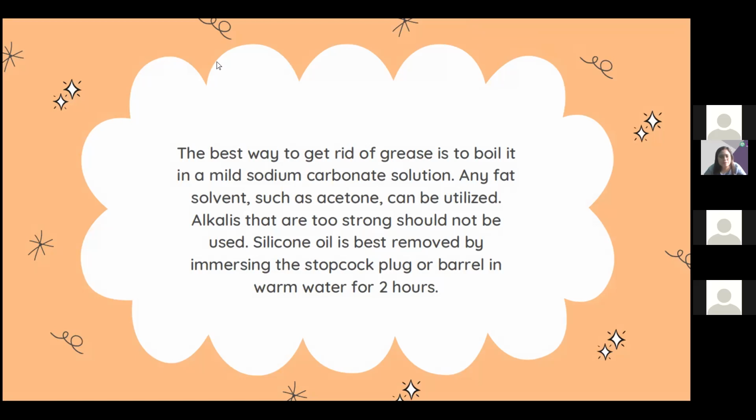So, pwedeng gamitin yung, well, let's see. Ah, yeah, the mild sodium carbonate. This one is an example of a weak alkali. So, hindi natin ginagamit yung strong ones like the sodium hydroxide. Okay? Silicone oil.